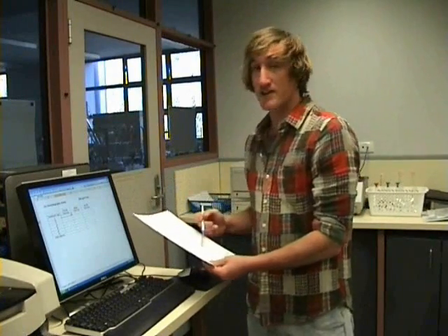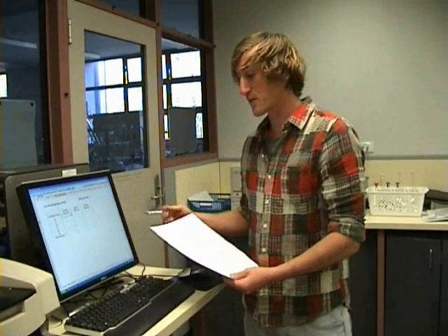From there, we go to our peak areas and put them on a spreadsheet, which corresponds to the concentration of our original sample that we used. After we do this for a range of concentrations, we then create a calibration curve, which we use to determine the concentrations of our unknown.